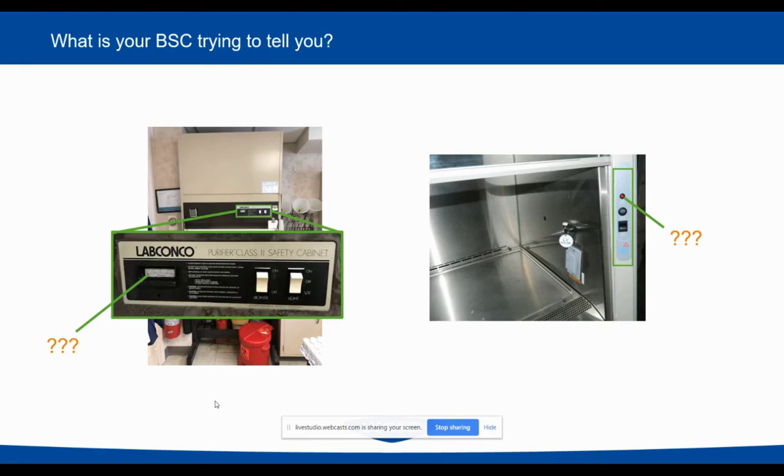And so these are things on biosafety cabinets that are indicators that something is wrong, but may not tell you the full story. So if you have an older biosafety cabinet, please be aware that these are not replacements for, or full communicators of, exactly how the biosafety cabinet is performing. You do need to seek out a third-party certification and make sure that it's probably on a more relevant, frequent schedule than the typical 1 year, just to ensure that the biosafety cabinet is operating safely.